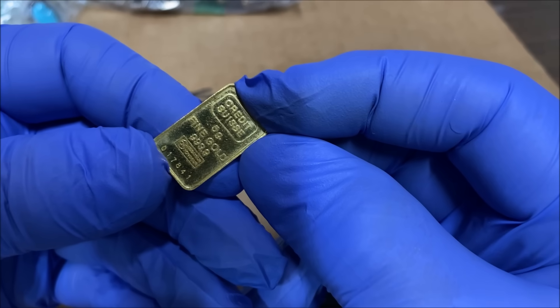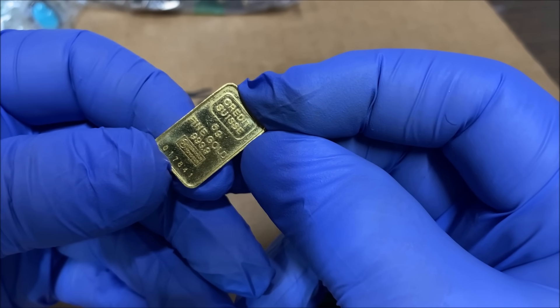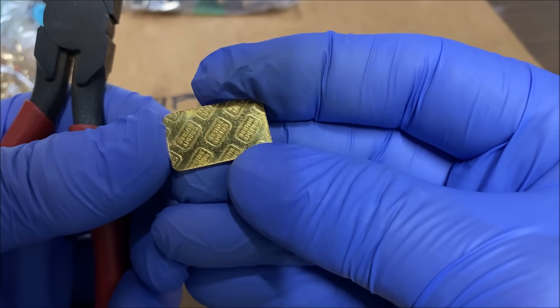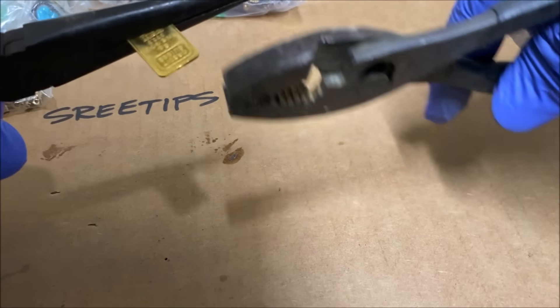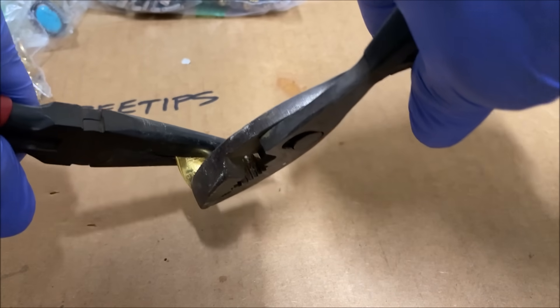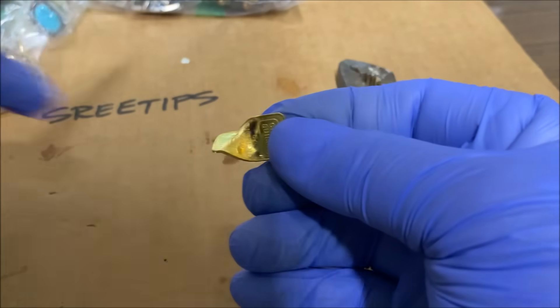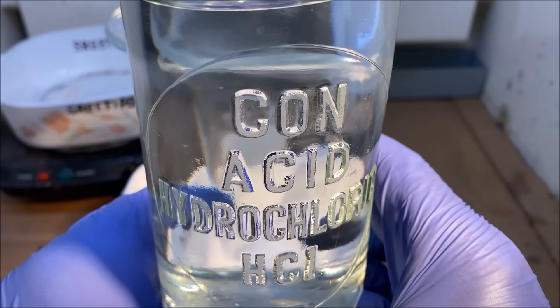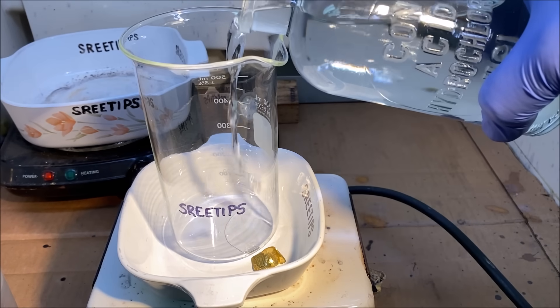I'm going to precipitate it back out, melt it into a little button, and check to make sure this is in fact four nines gold and not just 90 percent. I'll begin by bending the bar a little bit — it's real soft and should bend easily, and it does. I'll bend it so it doesn't sit flat on the bottom of the reaction vessel. Then I'll add about 150 milliliters of hydrochloric acid to the beaker.